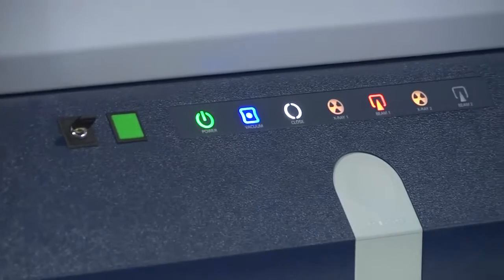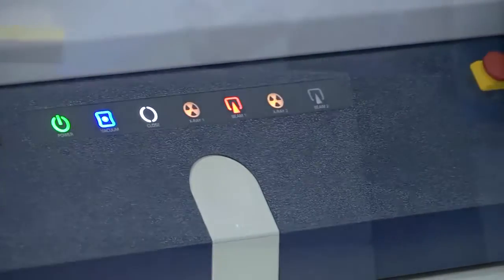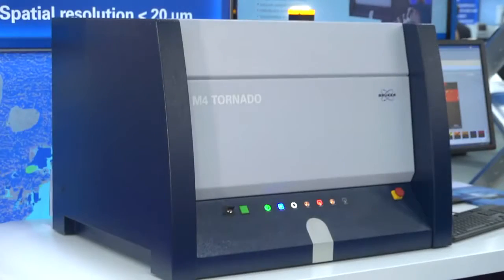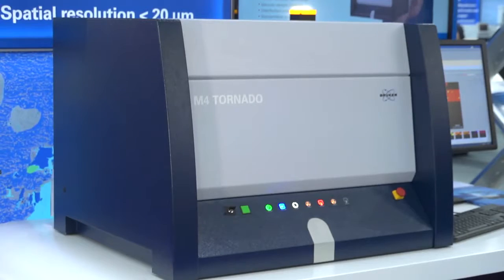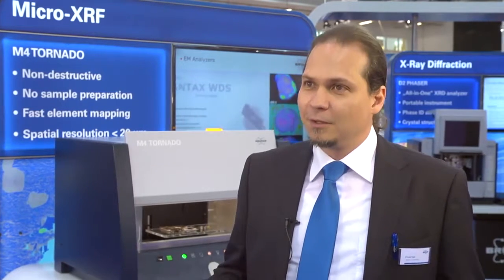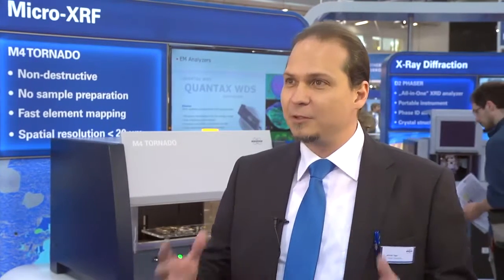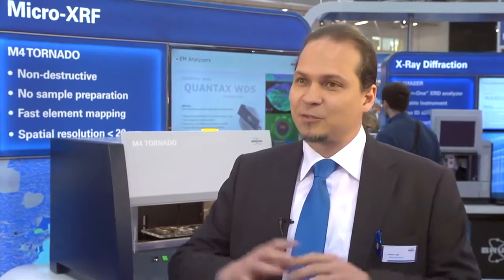The M4 Tornado, and let me go a little bit backward in time, I have been involved from an application point of view with the M4 since the beginning. Now we have more than four or five years of working on the instrument. I have seen the development and introduction of the instrument in many fields. It's very difficult to give one key field where we have seen the instrument used more and more, because it's spreading over many application directions.